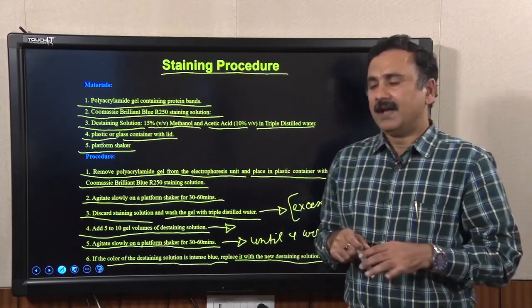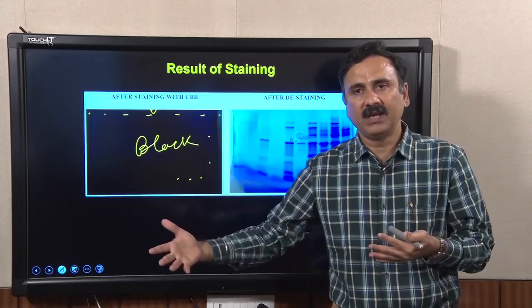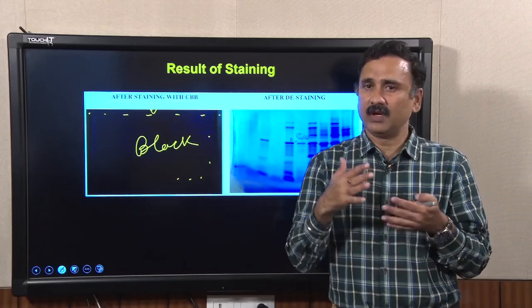bound places. And if you stain the gel with Coomassie Brilliant Blue in the beginning, the gel will look like a black film, and this is because Coomassie Brilliant Blue is going to bind everywhere irrespective of whether you have protein or not, which means it is going to bind to the polyacrylamide as well as the proteins, but the affinity of Coomassie Brilliant Blue for the polyacrylamide and for the protein is going to be different.